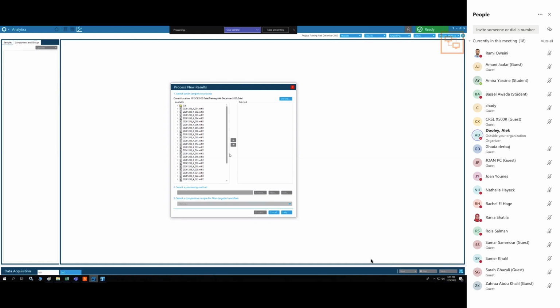And then you will find nothing, even though it's there. So be very careful. Even though you are not doing quantitation, you are still finding the compounds in that method, number one, by retention time. If the peak is not in your retention time search window, you will not find it, and it will give you a negative result, even though it's there. So do be careful about that. If you change your chromatography, you need to be thinking, my retention time's changed, I may need to change my method. Does that make sense to everyone? Yes, makes sense. All right, great.